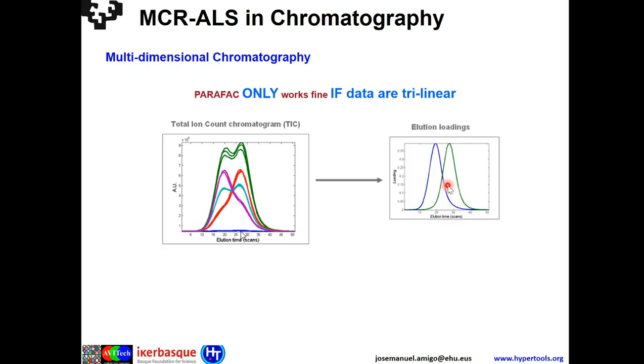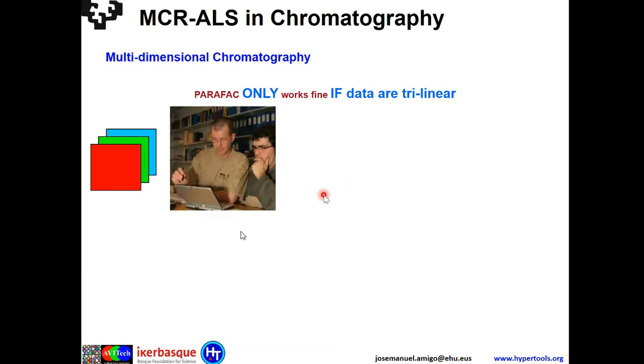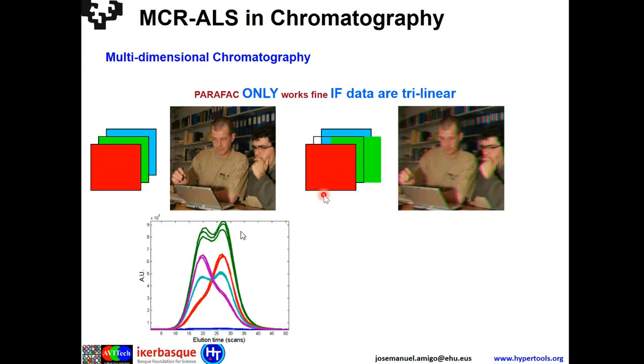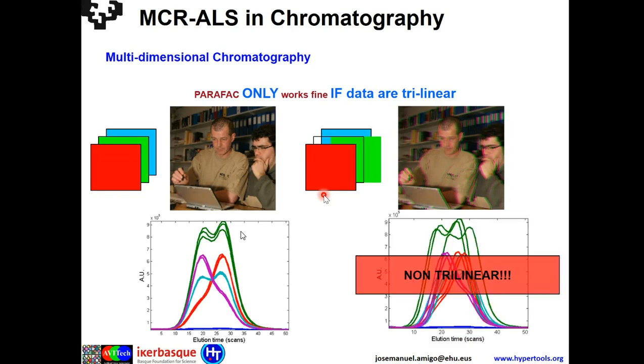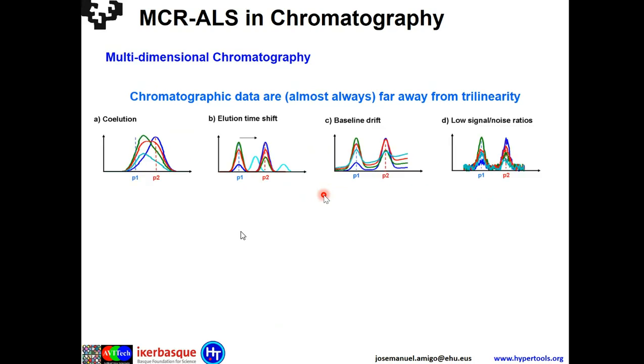There is a method that works very nicely when everything is fantastic. But this, as I said before, is not very typical in chromatography. We have the problem of losing trilinearity. I'm going fast because we saw these slides before.